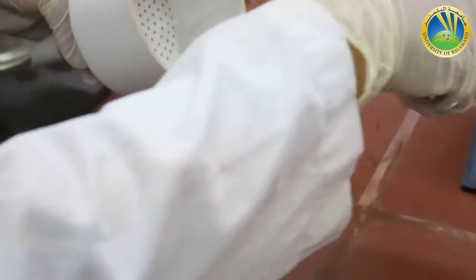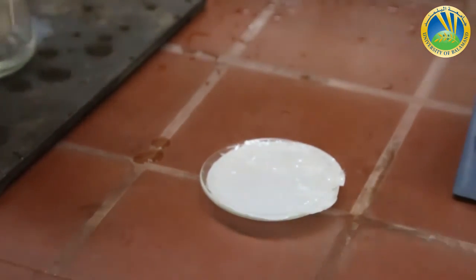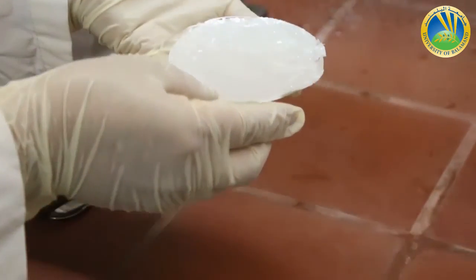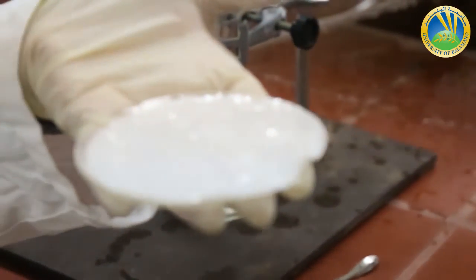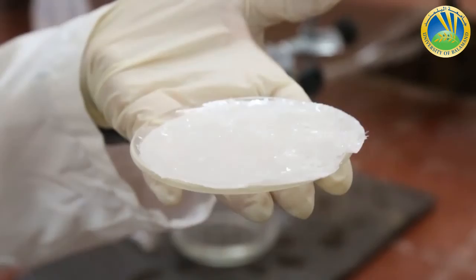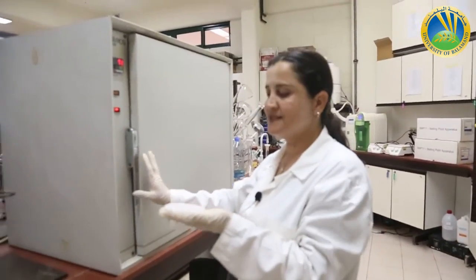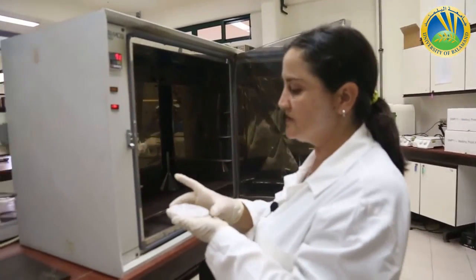Okay. Now my solid is transferred here, and now I have to put my filter paper with the crystals inside the oven for a few time to let it dry completely to get the weight of the crystals. This is our oven. This is our wet compound on the filter paper.